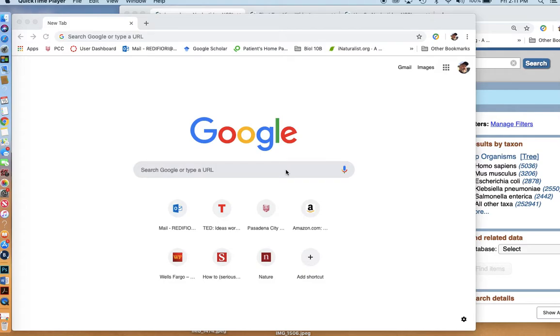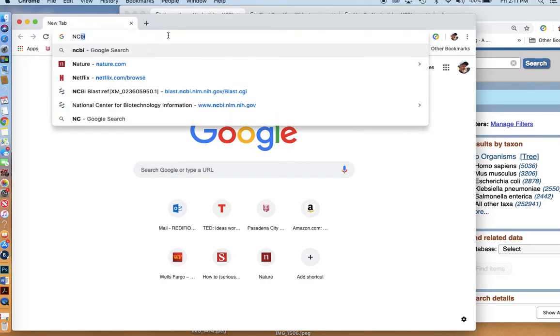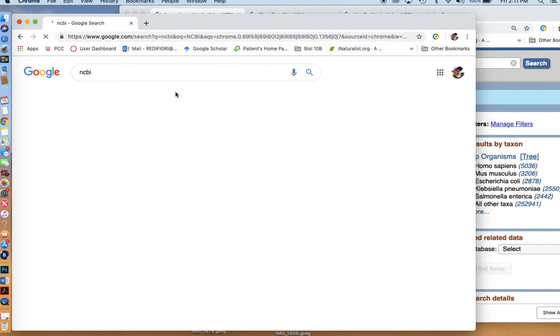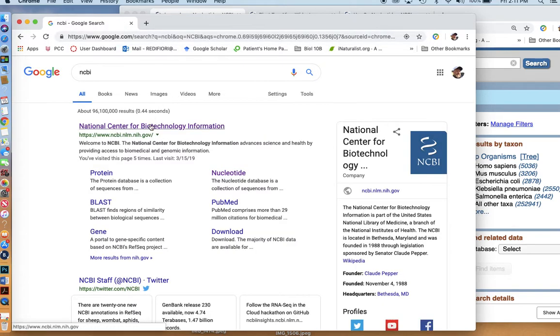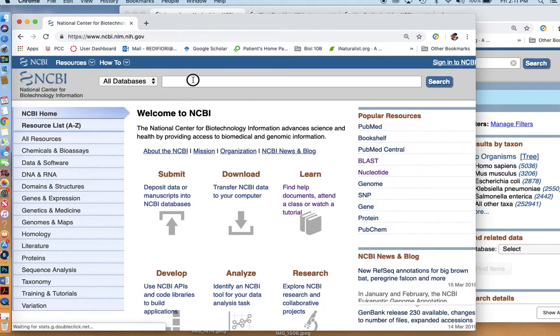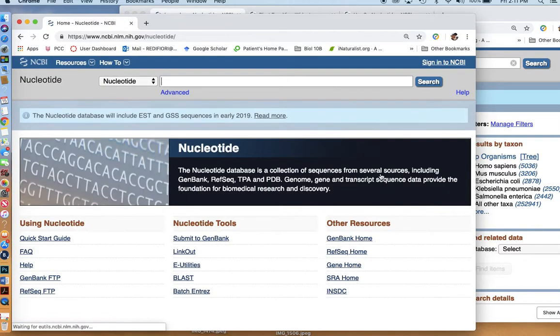How to use the NCBI BLAST tool to explore some phylogenetic relationships among animals. We'll start off by going to the NCBI website and looking for some genes. I'm going to type in homeobox gene and look in the nucleotide sequence area.